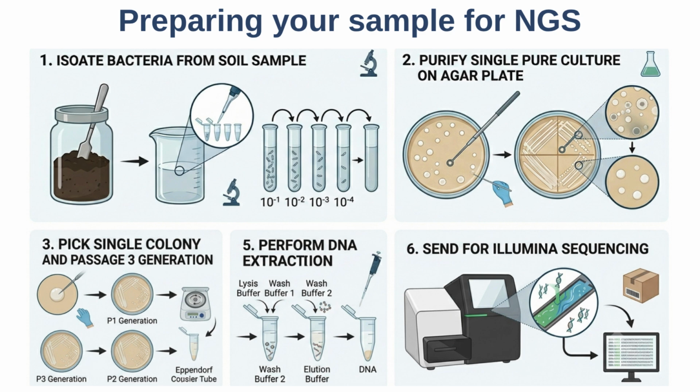After sufficient bacterial biomass has been obtained, extract the genomic DNA and evaluate its quality, concentration, and integrity using appropriate QC methods such as spectrophotometry, fluorometric quantification, and gel electrophoresis. Finally, once the DNA passes quality control, submit the sample for whole genome sequencing. The sequencing provider will then proceed with library preparation, sequencing, and data generation for downstream bioinformatics analysis.